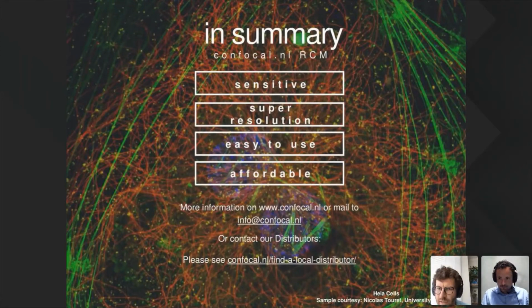Then the next question was about the field of view. Is the field of view only 1/4 of conventional imaging, since it's divided the camera chip into 4 for the multicolor acquisition? Yes, correct. We're splitting the camera into 4. So if we use a 2K by 2K, we basically have a 1K by 1K 4-color image.